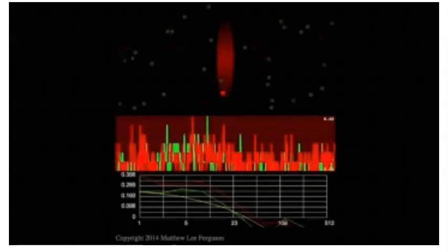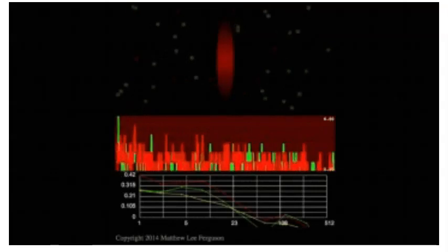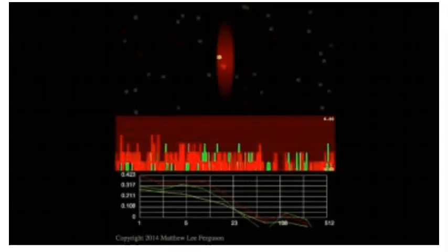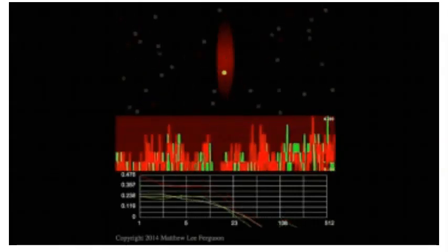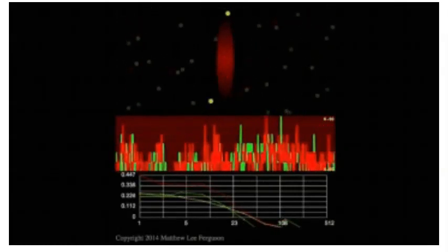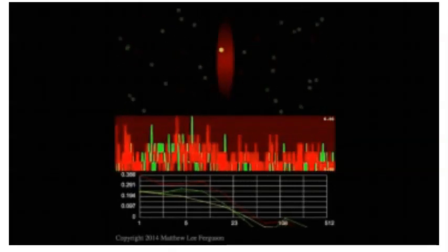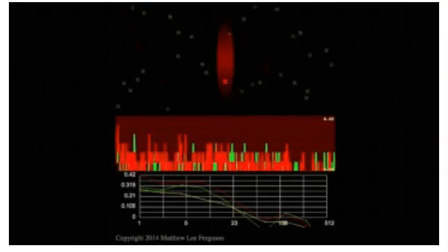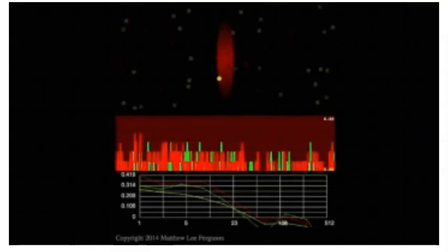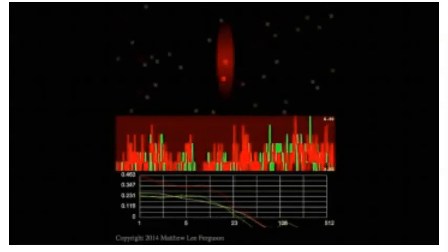When two labeled proteins enter the volume together, their emitted photons become cross-correlated. The yellow cross-correlation curve displays this cross-correlation. The stronger the coordination between the labeled proteins, the greater the amplitude of the cross-correlation function. The red and green curves show the autocorrelation functions for each labeled protein. The shape of these functions allows us to determine the dynamics of protein diffusion within the membrane.